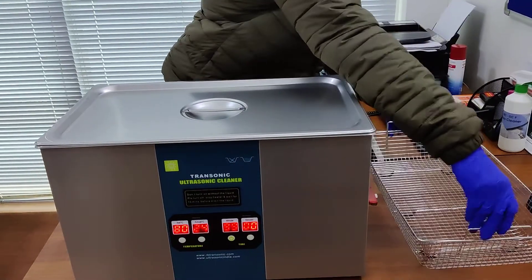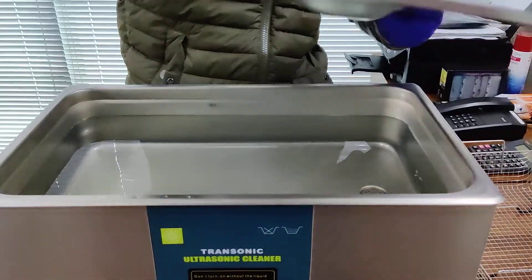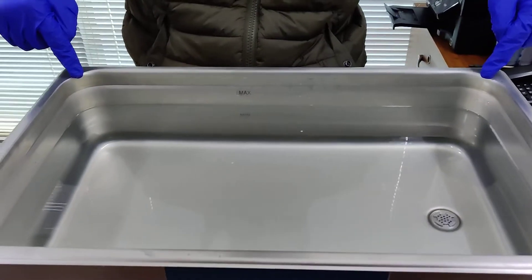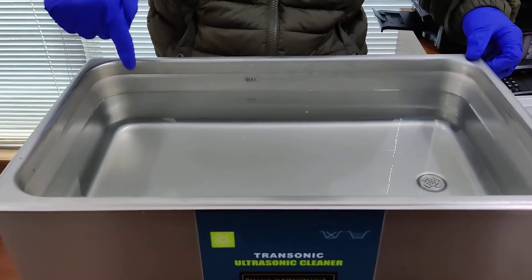The machine also comes with a lid — it is a stainless steel lid. The size of the working tank of the machine is 20 inches in length, 12 inches in width, and 6 inches in height.